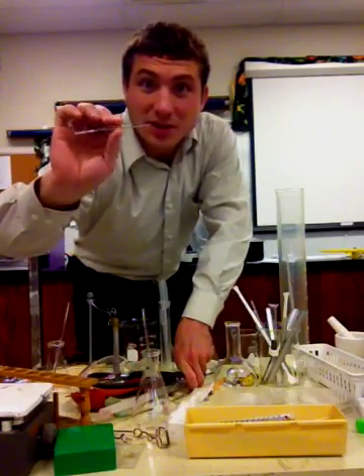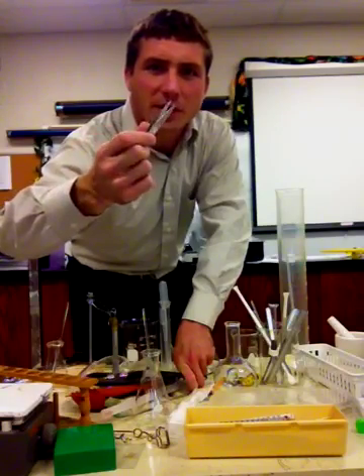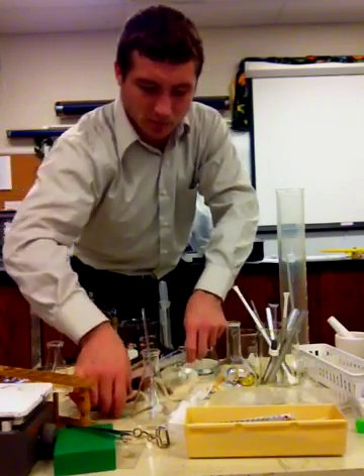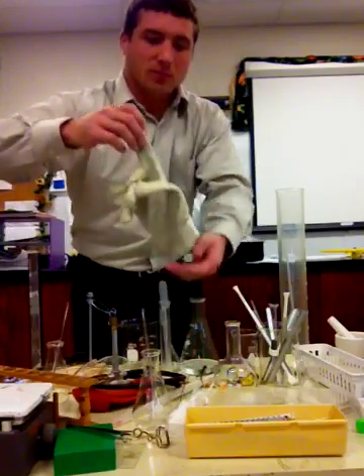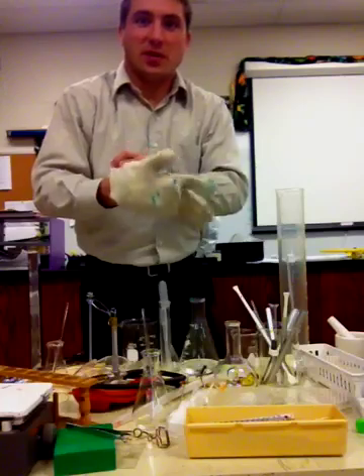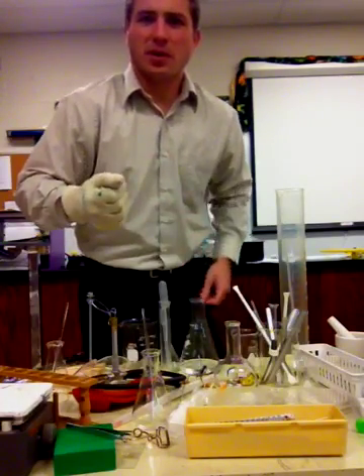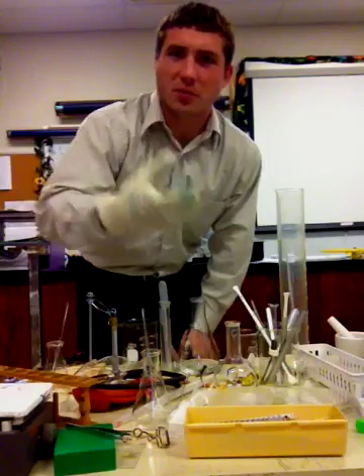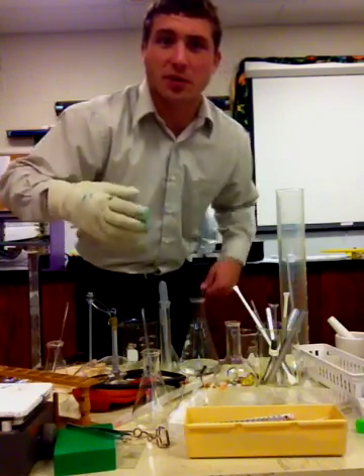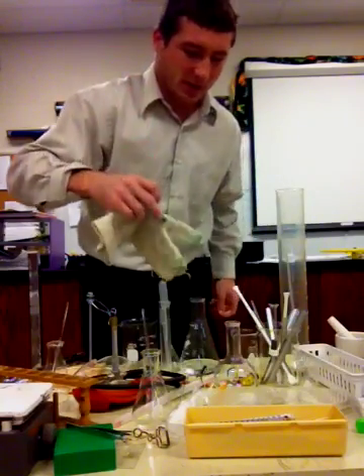Right here, these trusty little tweezer-looking things are known as forceps. We also have a hot glove. You may have seen your mom or father pulling out dishes or pans from the oven with one of these. We also use it to protect our hands from extremely hot or cold items in the lab.